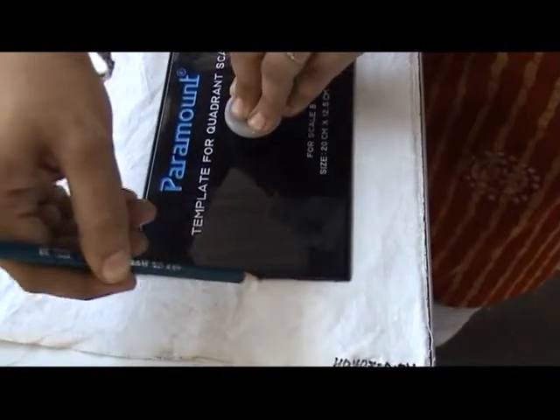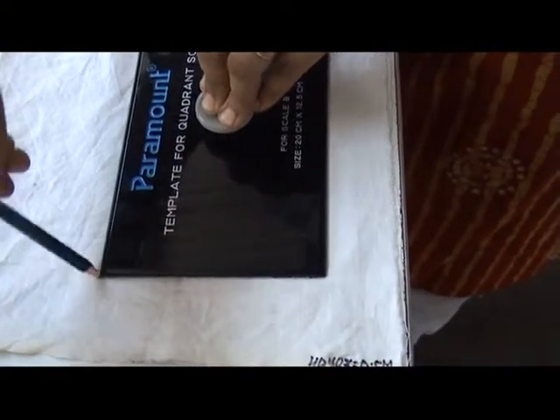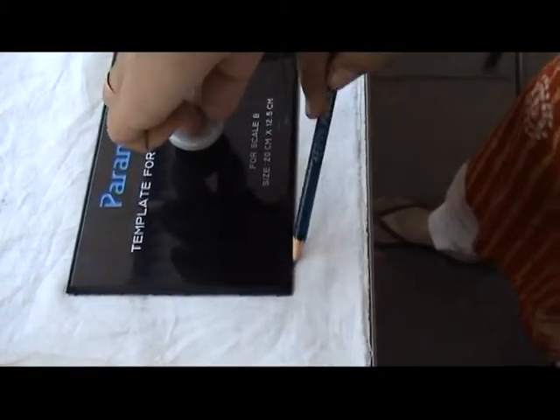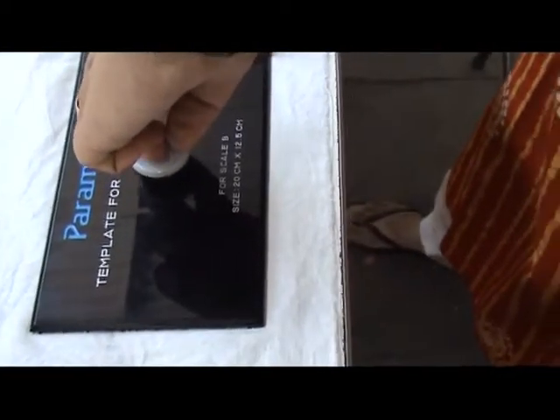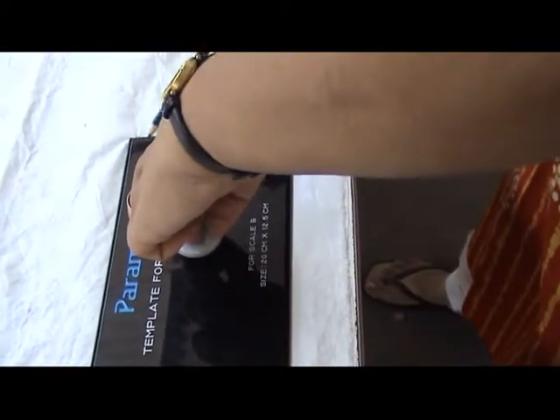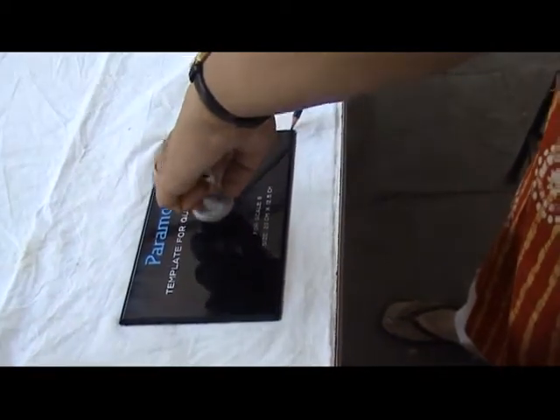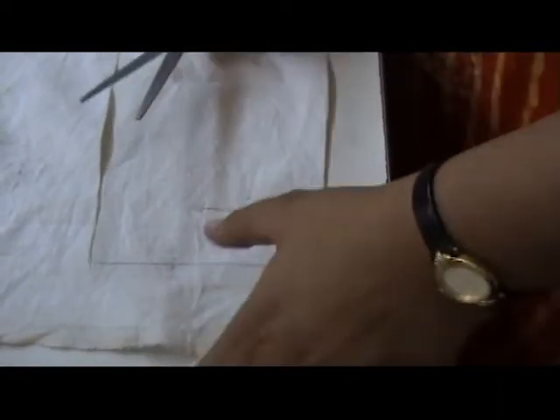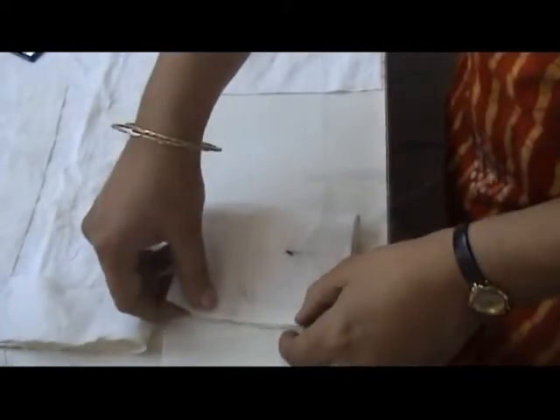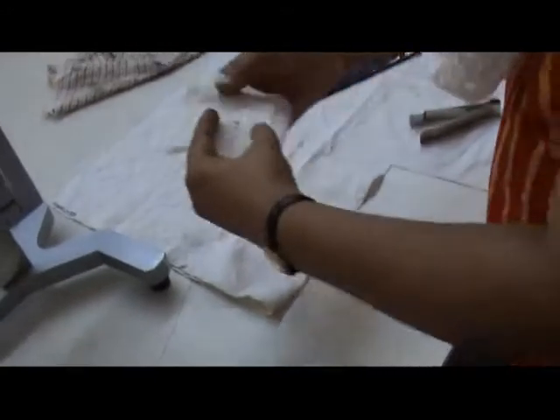The template is kept on the surface of the fabric and its outline is marked with a marker, which is supplied with the quadrant scale. The sample is cut on the marked line with a pair of scissors. Five such test samples are prepared.